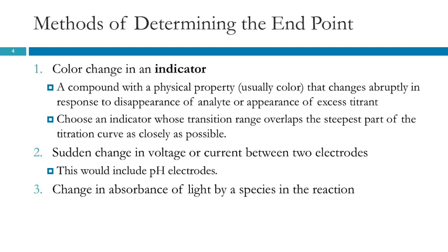How much of a color change is it? You've probably asked yourself or asked your instructor, is this pink? Because you want to get just barely there, but then sometimes you're not sure because it's such a slight color change, and so that can be an issue.